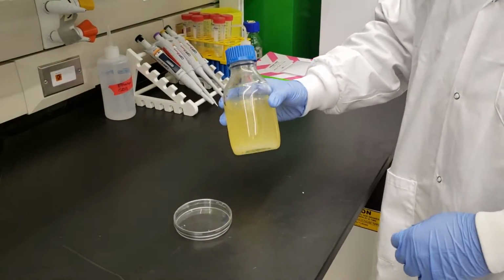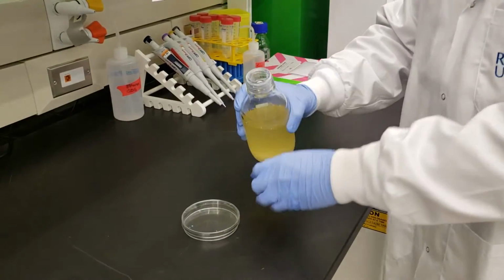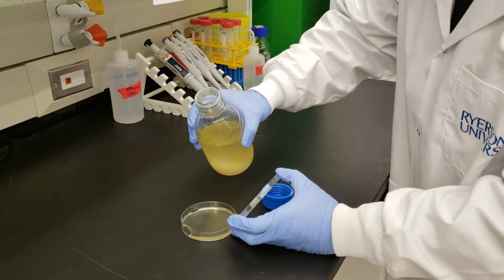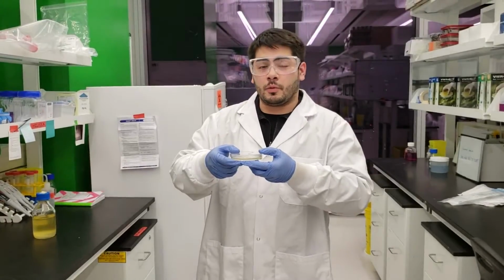Now while your agar is still hot, but cool enough just for you to handle, it's time to pour some plates. You're going to want to pour just enough to cover the surface of the plate, which is approximately 10 milliliters, but you can eyeball it. That's everything for pouring our plates.